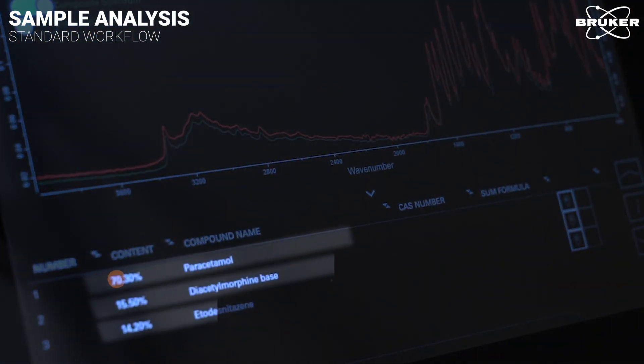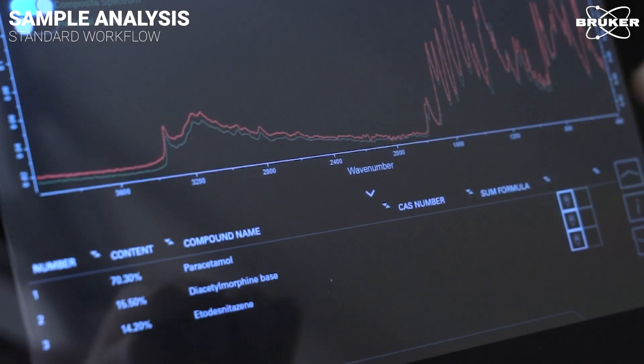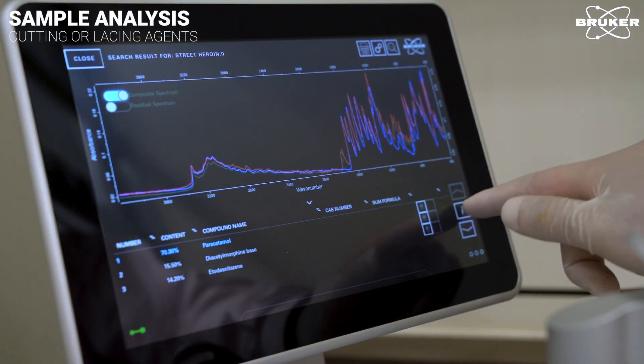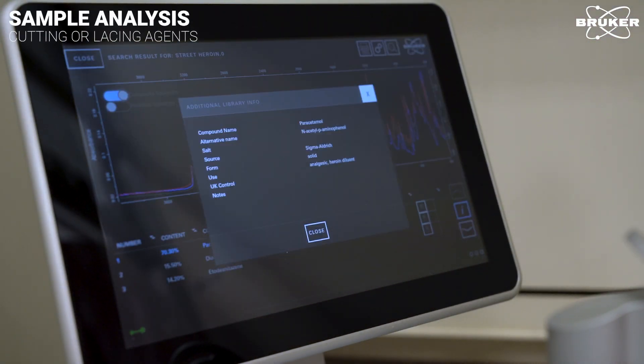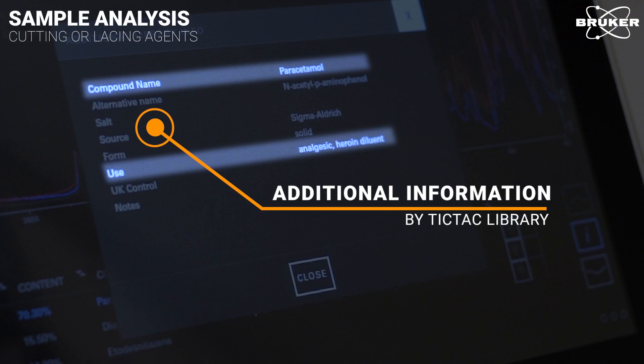Fortunately, FTIR spectroscopy provides a complete breakdown of the drug sample by using dedicated spectral reference libraries. A comprehensive list of ingredients yields information on the composition of the street drug. Additional information on identified drugs and lacing or cutting agents is provided by the TicTac library.